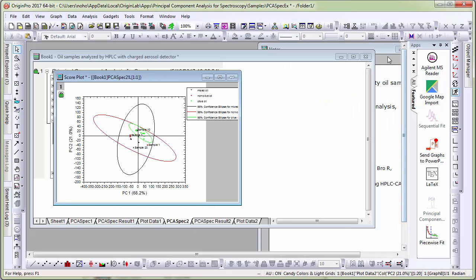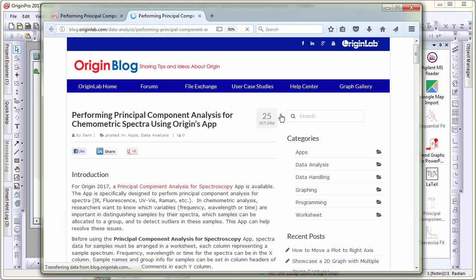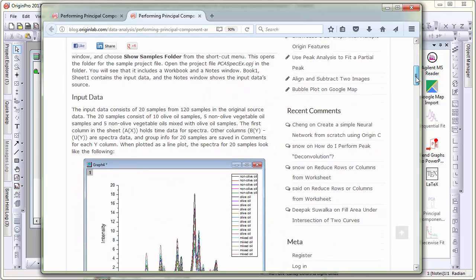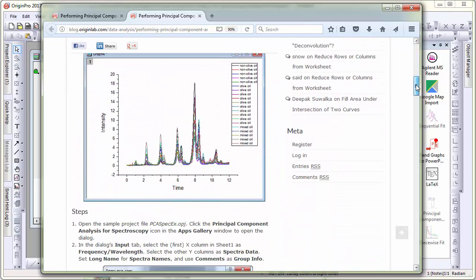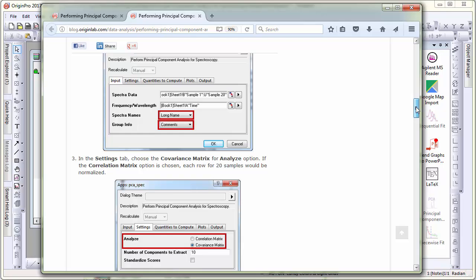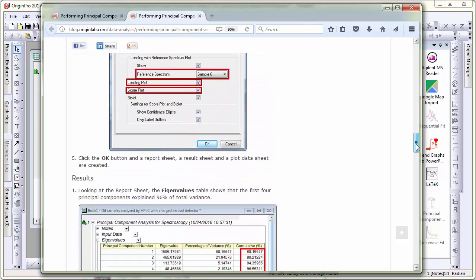There is a notes window in this project which points to a blog page. If you open the blog, this blog gives you a much detailed description of the analysis and how to interpret all the results.